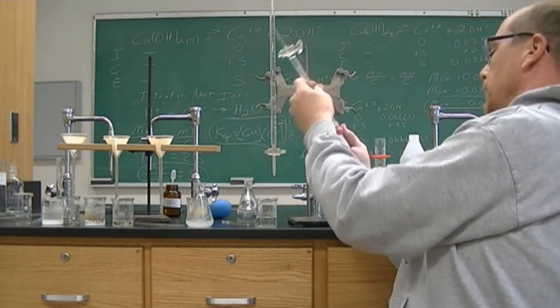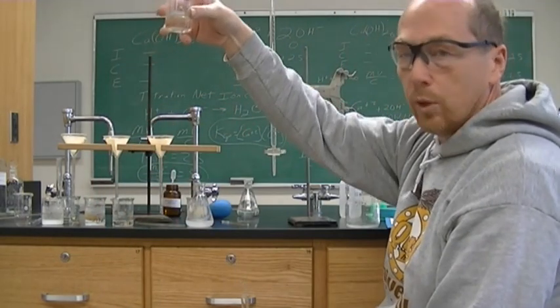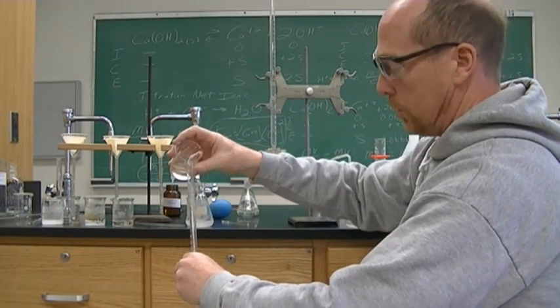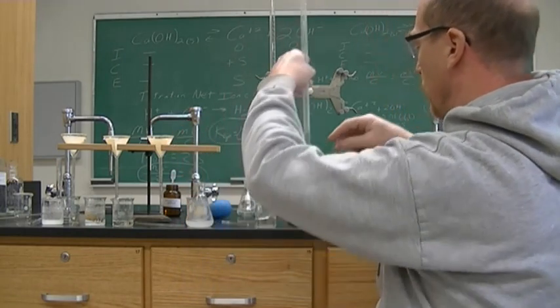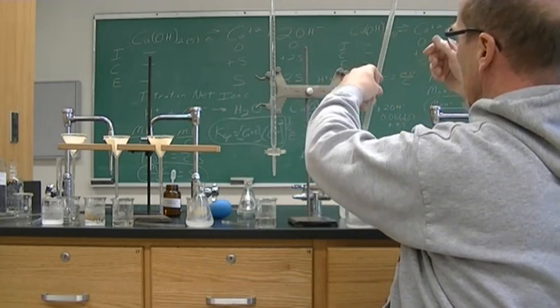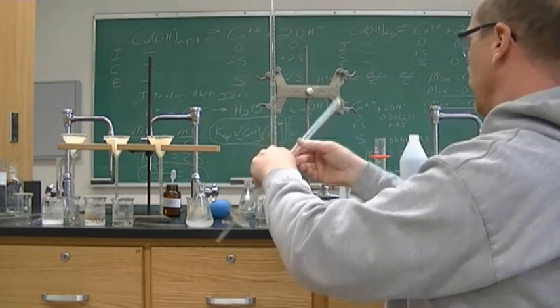If we mixed it, there was water in here or a different solution in here, we need to know exactly how much of this is being added, not diluted with the other solution, or if you rinsed it with water, it would be diluted with water. And so we thrice rinse it. Every time you change your solution in a burette, you thrice rinse it.